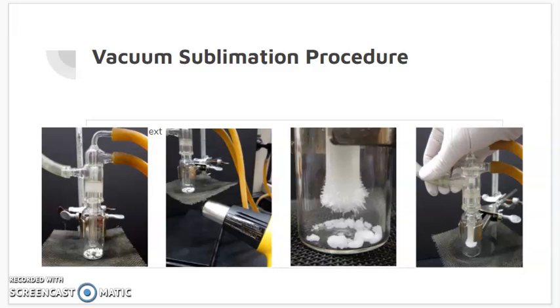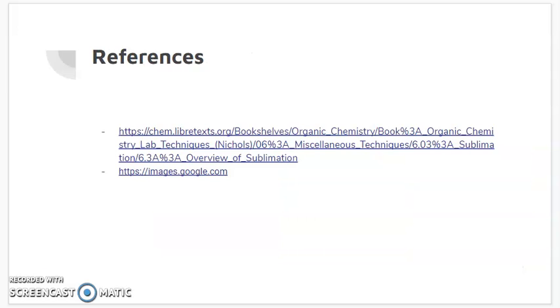The reaction is complete when a solid appears to have formed around the cold finger, as seen in the third picture. Remove the coolant used and allow the apparatus to cool to room temperature. Slowly open the apparatus to release pressure without dispersing the crystals in the fourth picture. Remove the cold finger from the apparatus. These are our references.